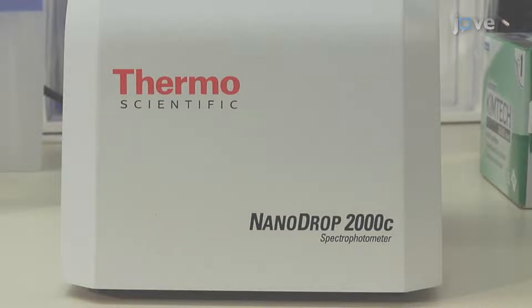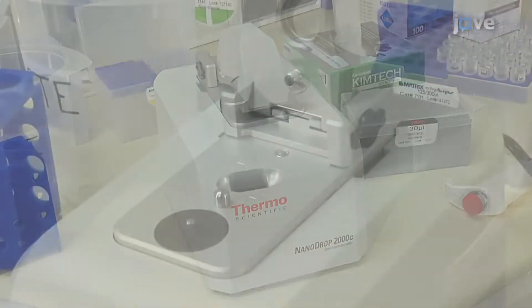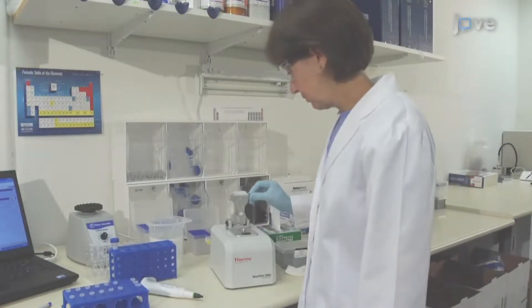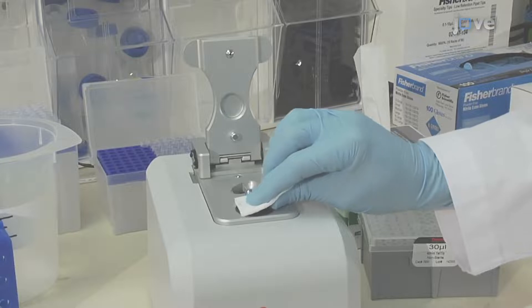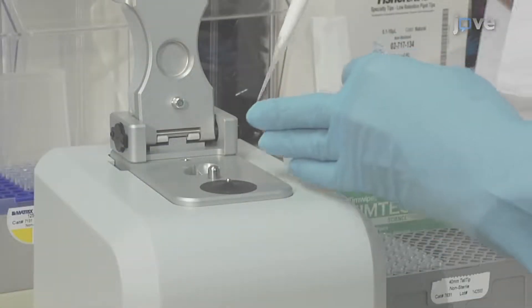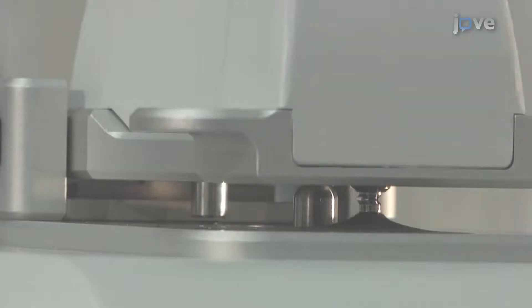The Nanodrop 2000C spectrophotometer uses an innovative sample retention system that relies on the surface tension of liquids to hold and measure micro-volume samples between two optical pedestals, without the use of cuvettes or capillaries. The micro-sample is placed directly on top of the detection surface, and a liquid column is created between the ends of the optical fibers by surface tension. This liquid column forms a vertical optical path.